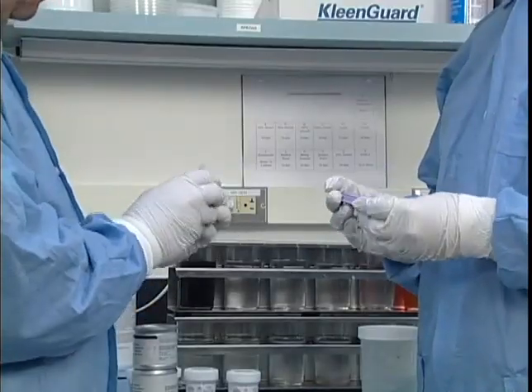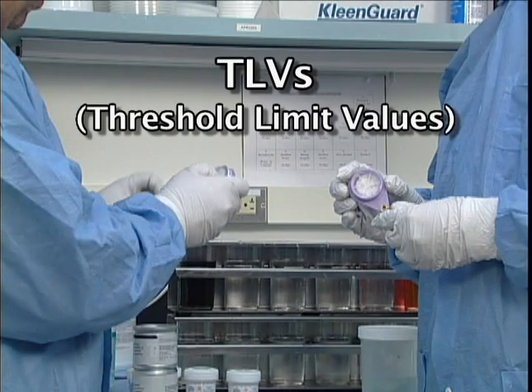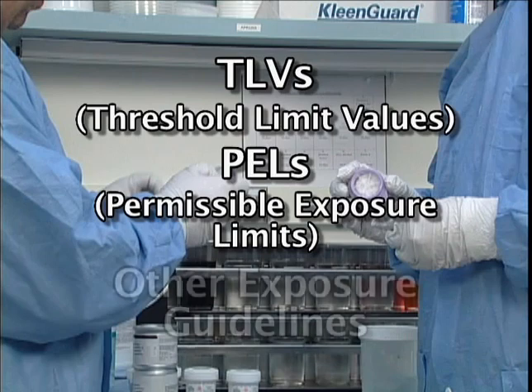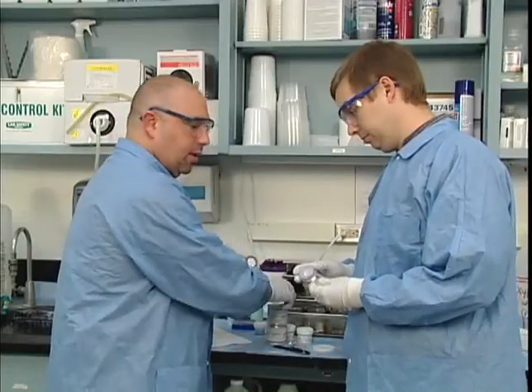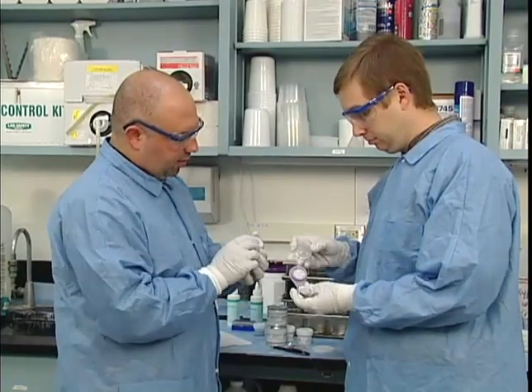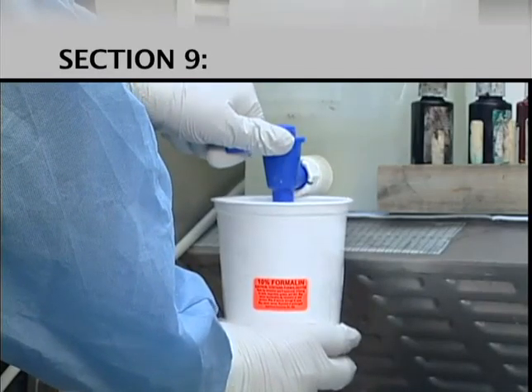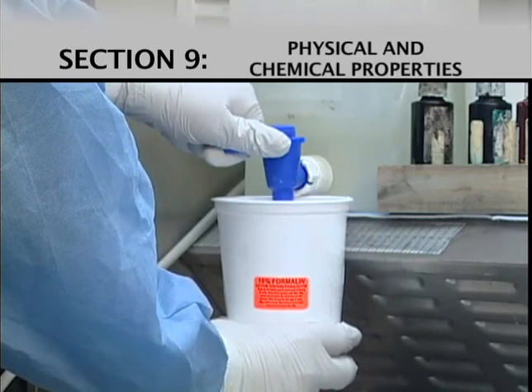Section 8 of the SDS will also list any TLVs, threshold limit values, PELs, permissible exposure limits, or other established exposure guidelines for the material or its hazardous ingredients. This information is used by your employer to determine the engineering controls and personal protection appropriate for the work you do. Section 9 of the SDS describes the physical and chemical properties of the chemical.